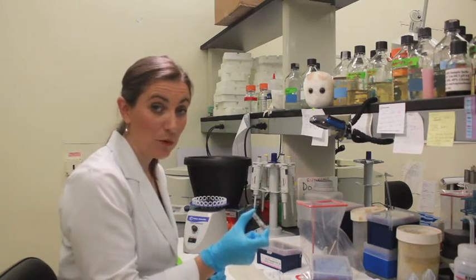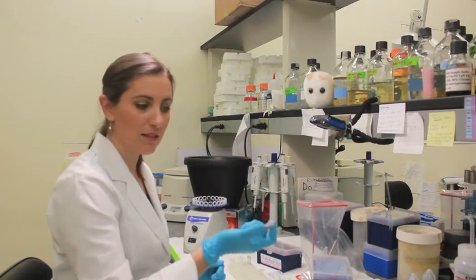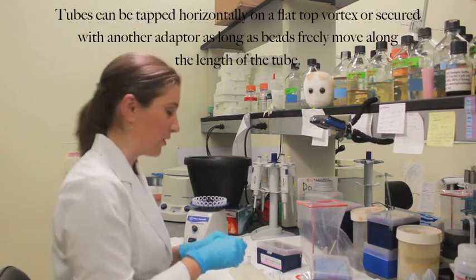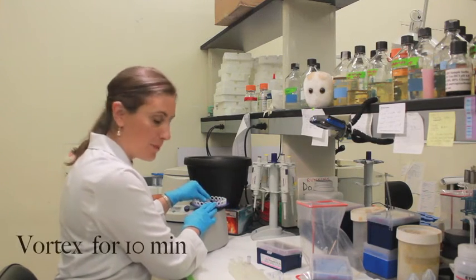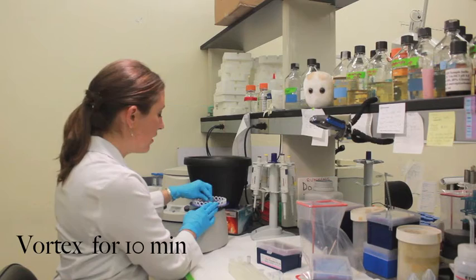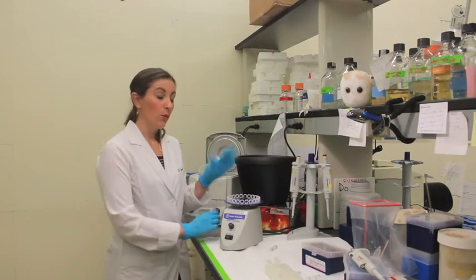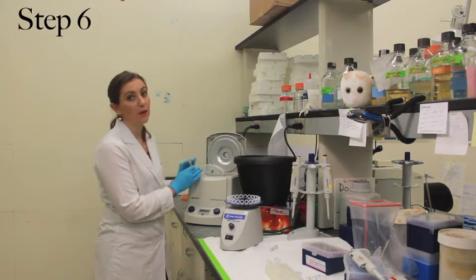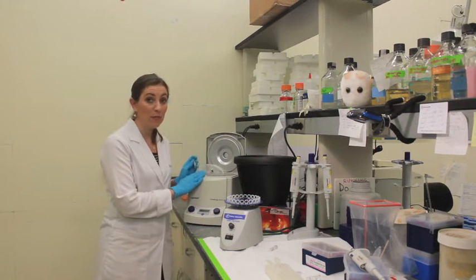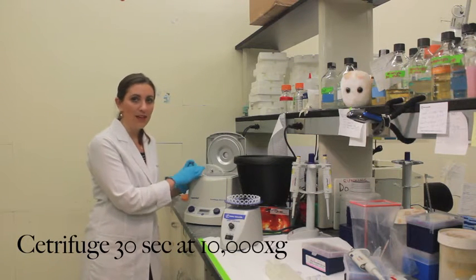Once the 60 microliters is added into the power bead tube, gently mix it with your hand, and then put it into the vortex adapter. When you are putting it into the MoBio vortex adapter, make sure that the lid of the power bead tube is facing the center. Once the vortex step is complete, your sample goes directly into a microcentrifuge — again, make sure it is balanced — and it will be there for 30 seconds at 10,000 G.